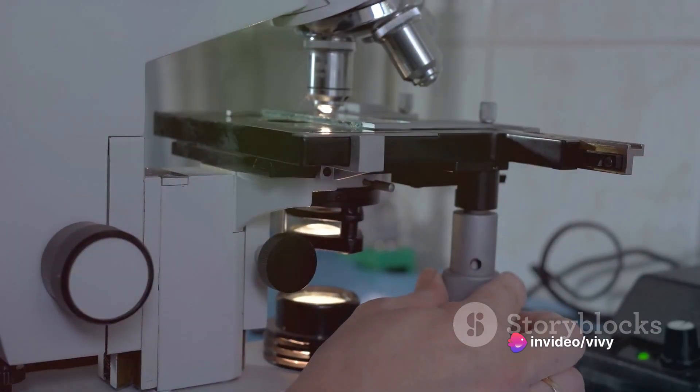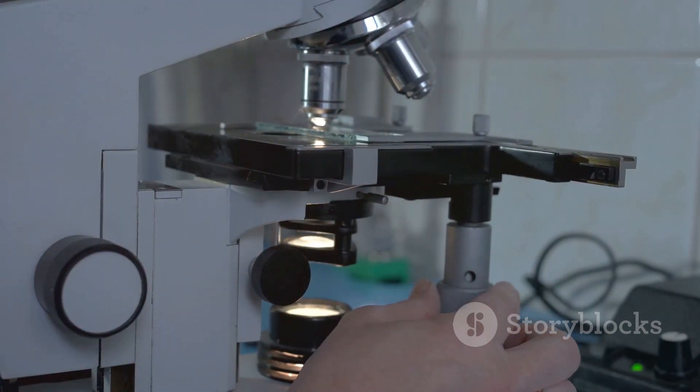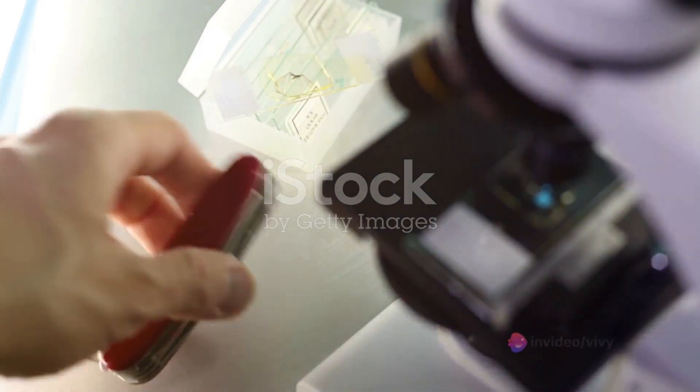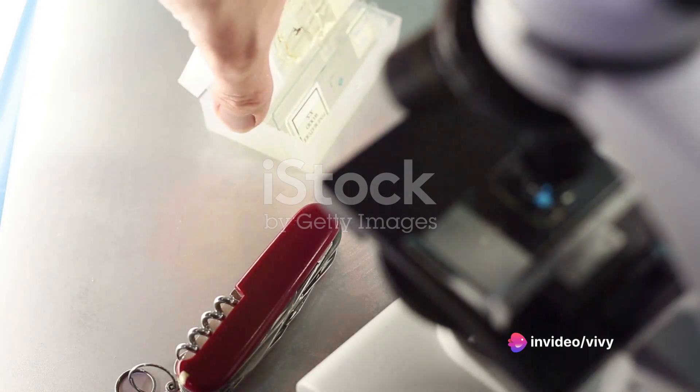First, gather the necessary equipment: a light microscope, a clean glass slide, a cover slip, a pair of tweezers, a razor blade, and a water dropper. Keep in mind, safety is paramount. Always handle the razor blade with care to avoid injury.